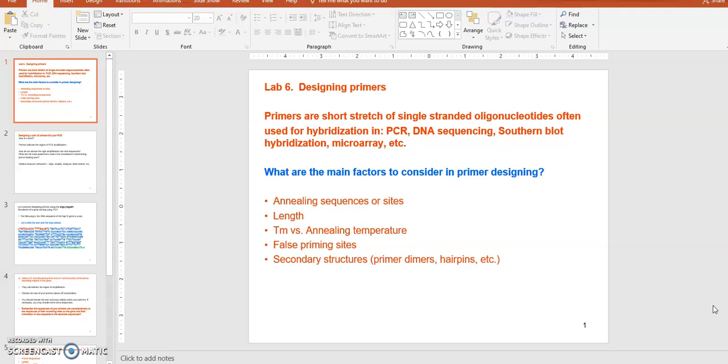But if you use 55 degrees, yes, it may bind, because it has a unique DNA sequence match. But how about those random binding sites? The binding happening between your primer and the DNA at maybe 50% efficiency, 40%, 60%, those bonds will be broken up at 55 degrees because the thermal energy is high enough to break up all those hydrogen bonds. Does it make sense?